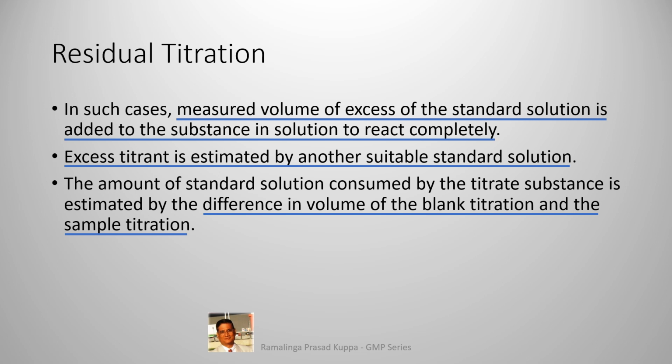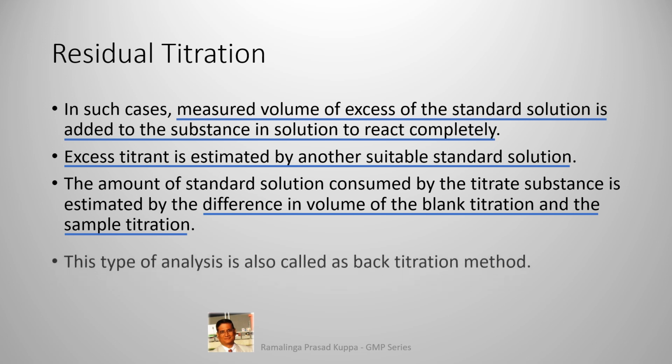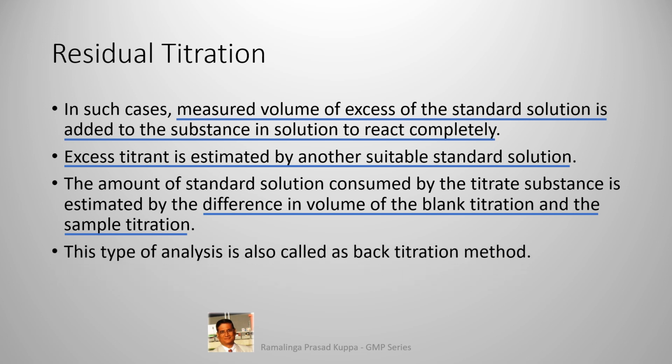So the volume consumed for the blank minus the volume consumed for the test gives the volume reacted. This type of analysis is also called the back titration method. This is another terminology for the residual titration method.